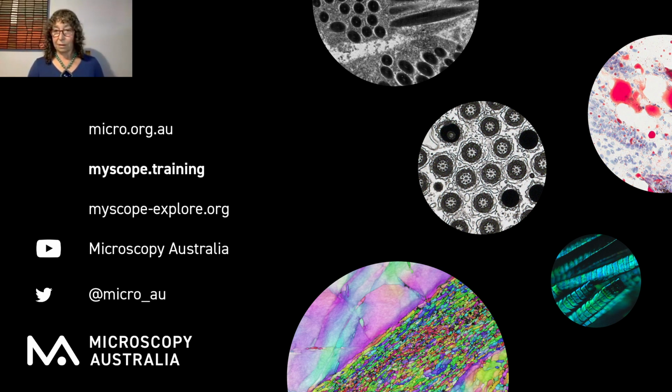Is there any plan to change or increase the number of samples, to have biological, physical, geological samples, for example? For MyScope, no, there are no particular plans to make the range of samples a lot bigger, mainly because we're trying to show people the approach to using the SEM, rather than giving them a wide range of examples of how different samples look.